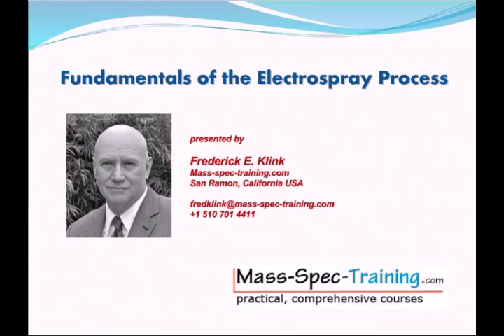Electrospray is the most widely used interface for LCMS in today's market. The reasons for this are varied, and we'll talk a little bit about that towards the end of this presentation. But my primary goal here today is for you to understand, one, how electrospray works, what goes on in the electrospray interface, and two, to understand some of the very basic parameters which users have to control in order to get the best success with electrospray.